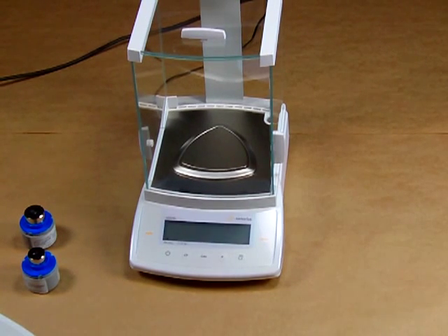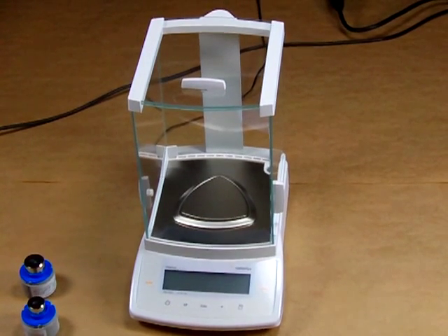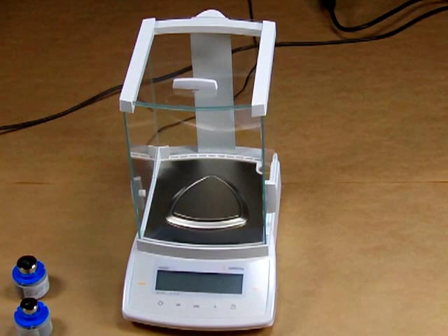Welcome to Precision Weigh-In Balances. Today we'd like to give a demonstration of matching the internal calibration weight with external weights. We're going to be using a Sartorius CPA324S. The first thing you need to do to perform the calibration and match the internal weight with external weights is to put the balance in the service mode.